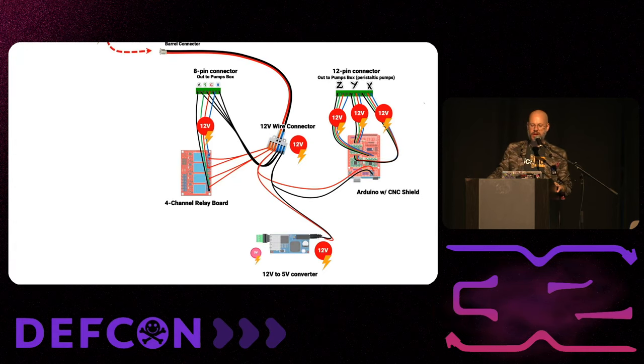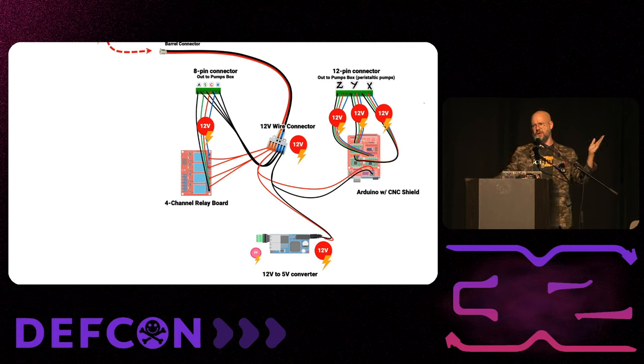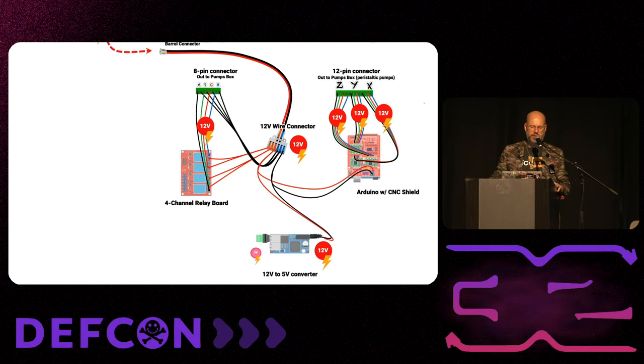So here you can see kind of how it's broken out. You've got these nice little snap togethers. The relay board, again, controls a number of things. There is a PID module that regulates temperature, and so you've got a heating element that's going to kick on or off as it predicts the curve of temperature as it moves, to try and smooth out transitions. Additionally, you've got something that turns the stir motor on and off, and also it's expandable. There are a few other things that you can do.